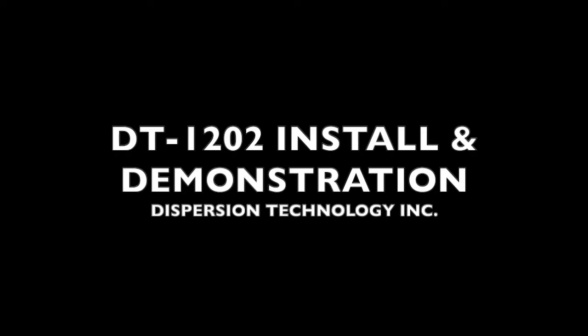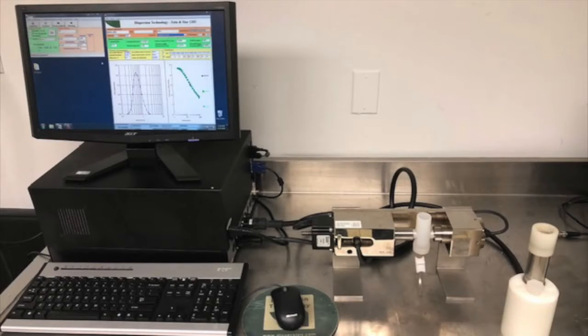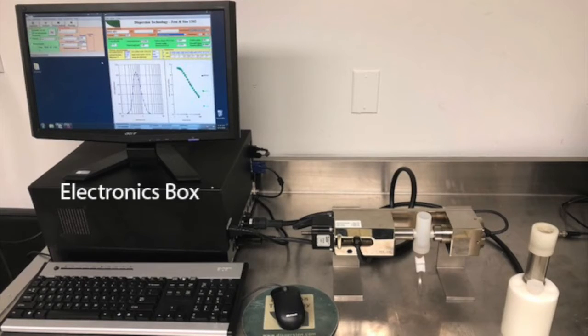In this video, we will demonstrate how to install the dispersion technology DT1202 particle size and Zeta Potential analyzer for concentrated suspensions and emulsions. The DT1202 is comprised of two components: an electronics unit which houses all of the necessary electronics and the sensors which are used for making measurements.